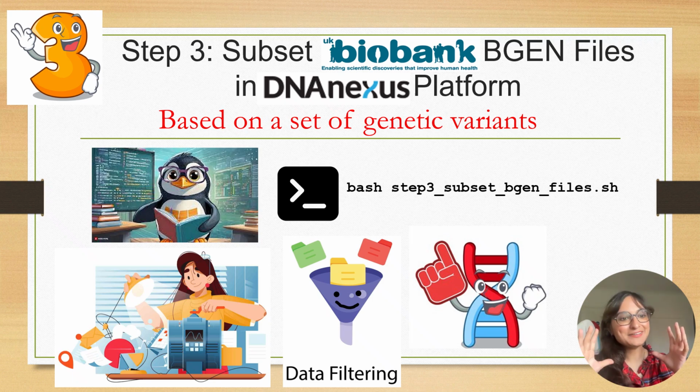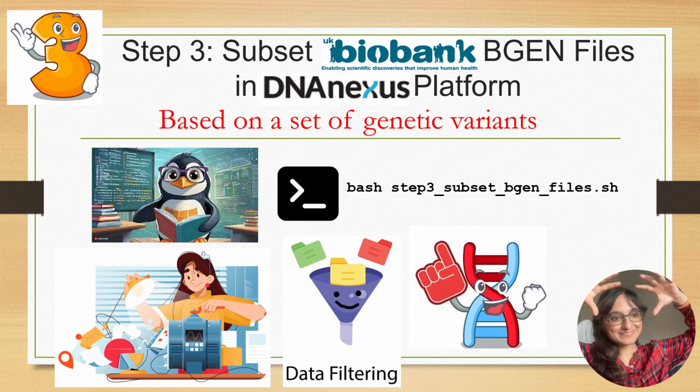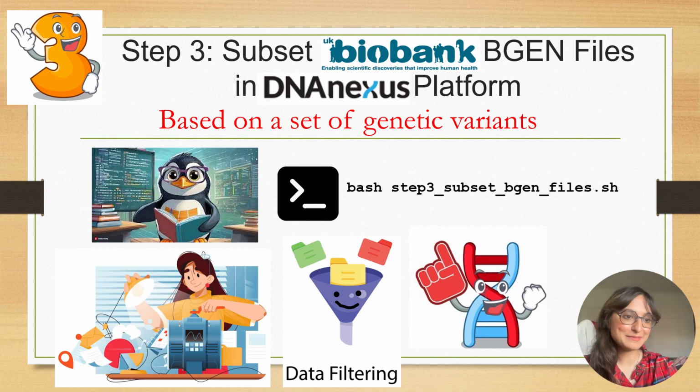So in step 3, we're going to subset these BGEN files. We're going to take them from these giant files and just subset them down to the variants that are important for our example, for our score file. And of course, for different score files, we could have different subsets.